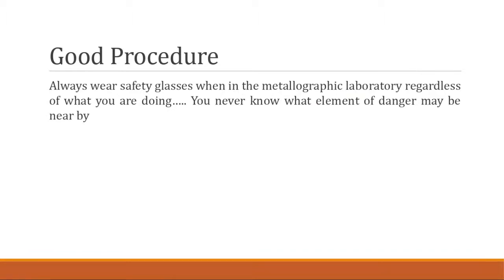So, a good procedure: safety glasses must be worn at all times, regardless of what you're doing in the laboratory. You never know what element of danger may be nearby. If you're in the lab and you're not wearing your glasses and somebody else is doing work in the laboratory, you never know how careless they can be. You never know when they might have an accident, and chances are you might be in that path. Which, of course, when we get into the labs, I'll explain a little bit more on a couple experiences I've shared in my time where somebody could have lost their eye.